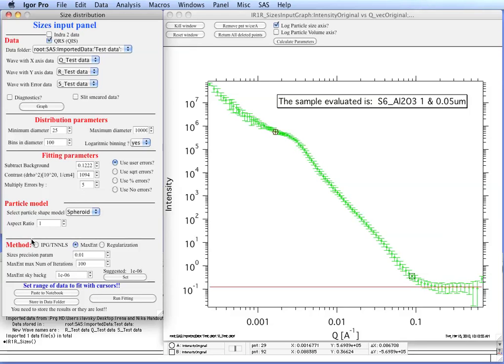There are three methods available here for analysis. Most of the time, the maximum entropy works really well. The other option is internal point gradient slash total non-negative least square method. I know it's a mouthful, but that's a method which works under some conditions also very well. Both of these have an advantage of being confined to only positive solutions, which gives physically reasonable results. Regularization, unluckily, is not bound to positive solutions and sometimes gets negative volumes, which is not particularly physical. You can try any one of these and see how they work. Let's try maximum entropy first.